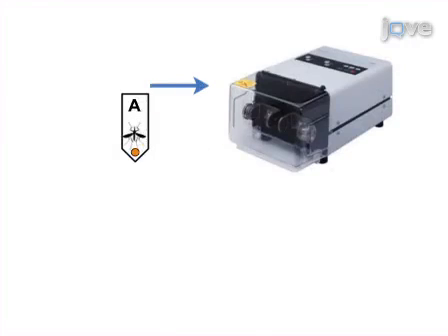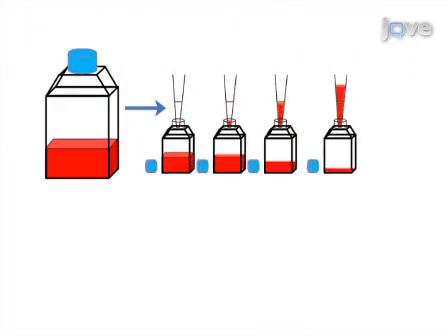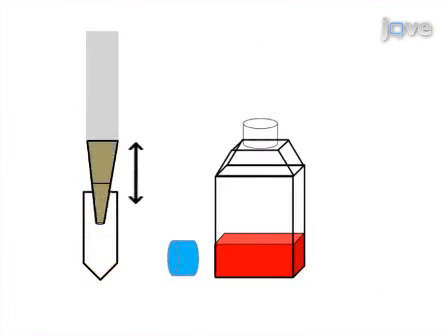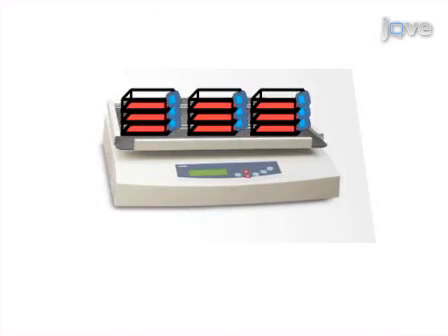Mosquitoes are then homogenized using a mixer mill. Once the mosquito homogenates have been made, varrocells are cultured in preparation for viral testing. Each varrocell culture is then inoculated with a single mosquito homogenate, placed on a shaker for five minutes, and then incubated at 37 degrees Celsius to allow viruses to propagate.